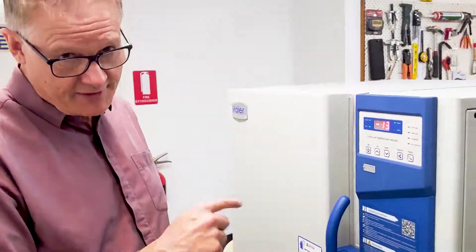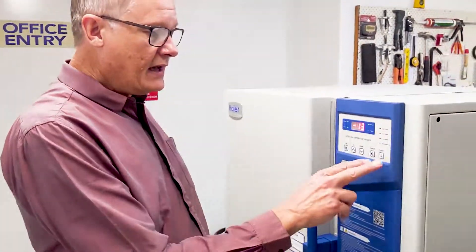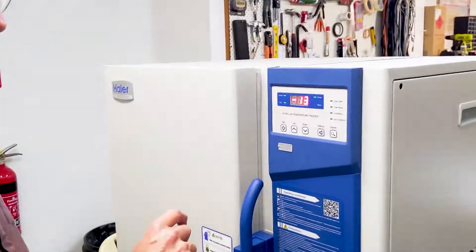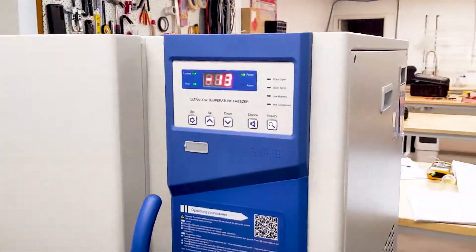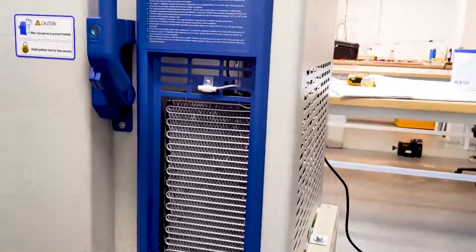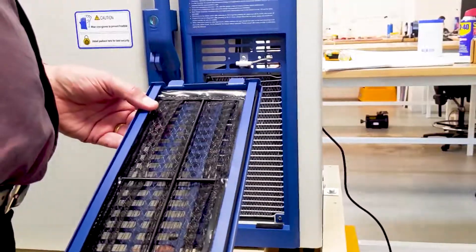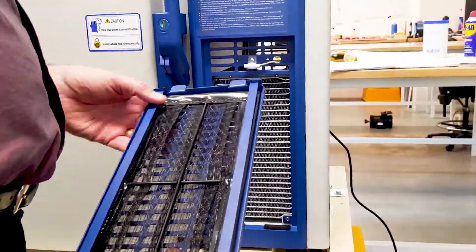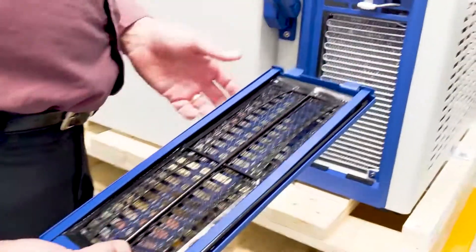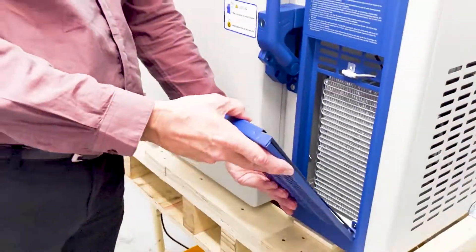There's a battery backup system where it will maintain the monitoring process if the power is inadvertently cut off for whatever reason. The battery doesn't run the freezer — it merely maintains monitoring. The fourth alarm is for a hot condenser, which is the vent here that lets the heat out. That might typically happen because the inbuilt filter is full of dust. The fans run all the time so dust will be sucked through, but it's very simple to clean.